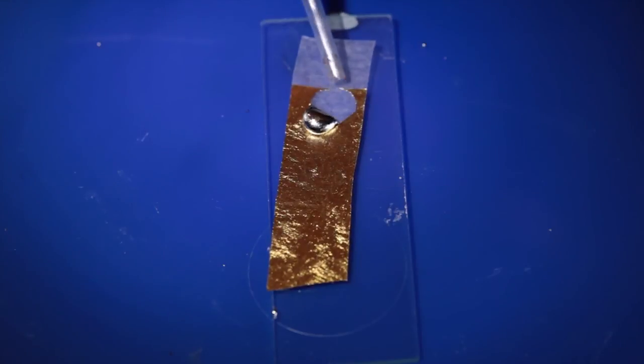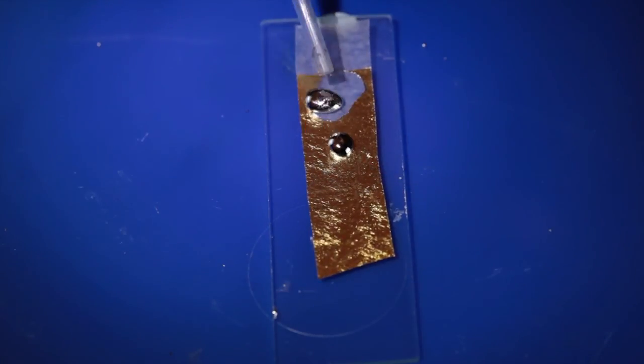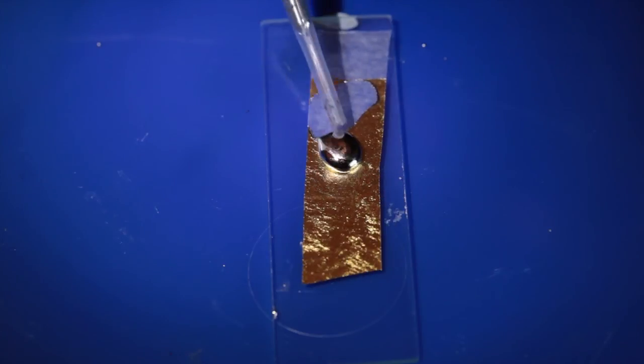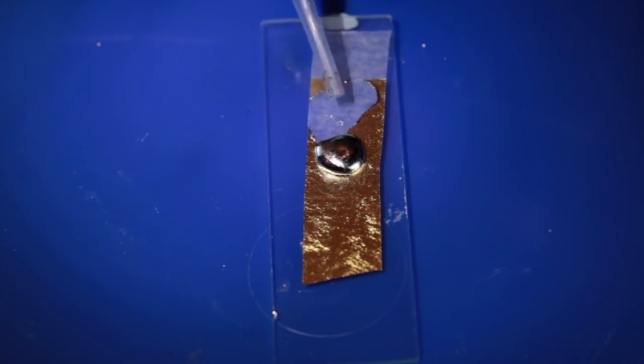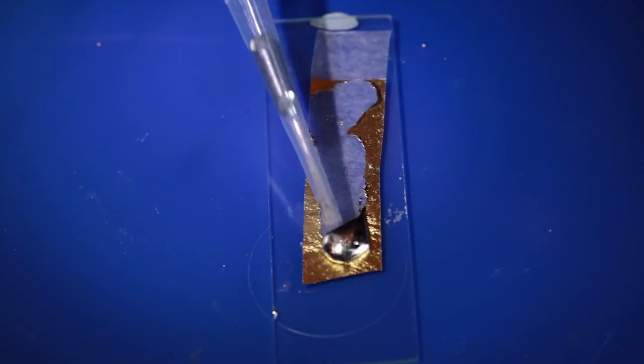I did have a go at distilling the mixture in a small retort to get the gold back, in an efficient fume cupboard, but the small quantities involved meant that the mercury disappeared pretty quickly, and the gold that was left behind — no longer spread out to a few atoms thick — was barely visible.